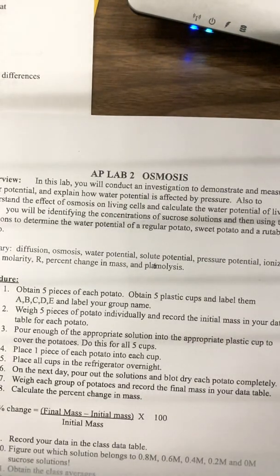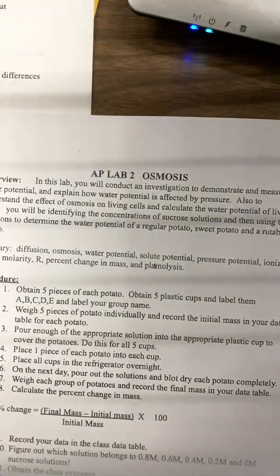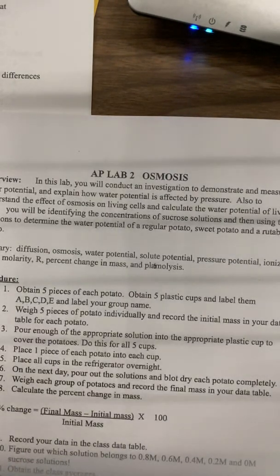Make sure you do your variables and your hypotheses. You will need 2 hypotheses, one alternate, which is a guess on which potato you think will have the highest water potential or the lowest water potential, and then the null hypothesis, which basically says that they will all have the same water potential.